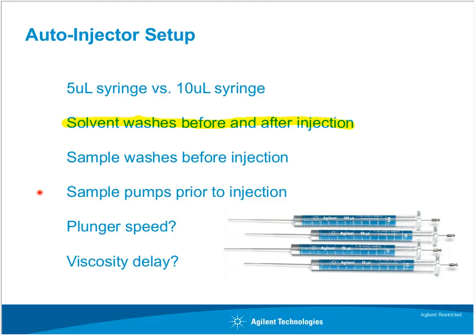With the sample pumps, we're really just trying to get rid of any air bubbles, make sure that we've gotten any residual solvent out of there, so we really have a good representation of our sample itself.